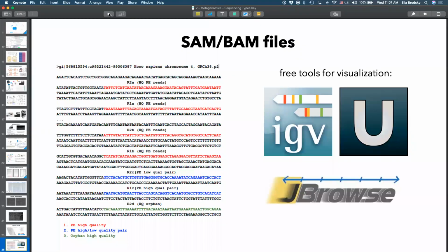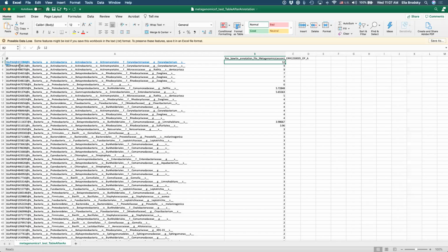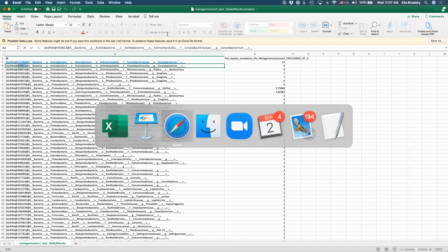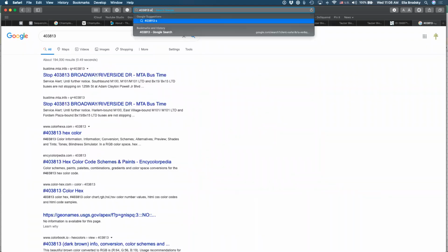So let's take a look. So you can see that the ID is different. If you want to understand more specifically, and you are correct that this is something you're going to start working with using that table. So this is from the Silva database.